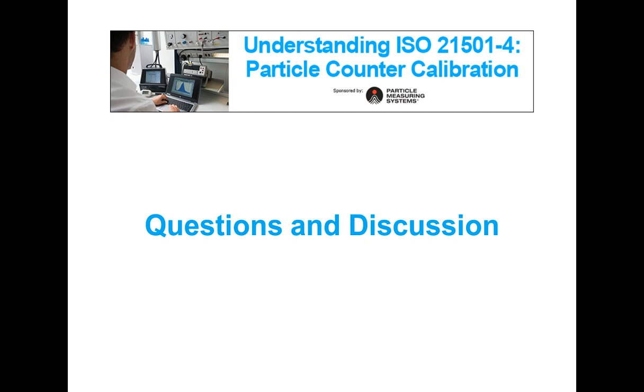And now we have a question: why should I look at the ISO 21501-4 as the standard for particle counter calibration?